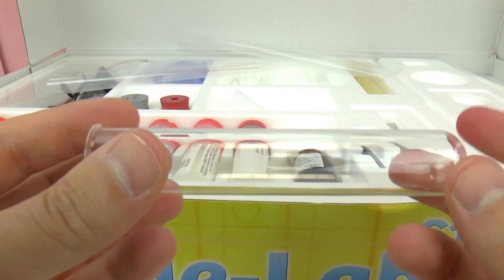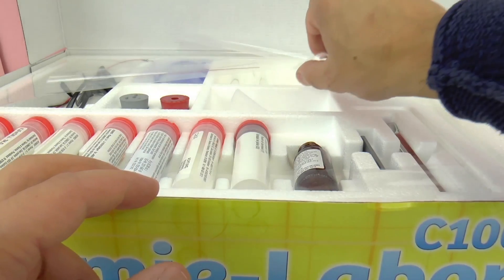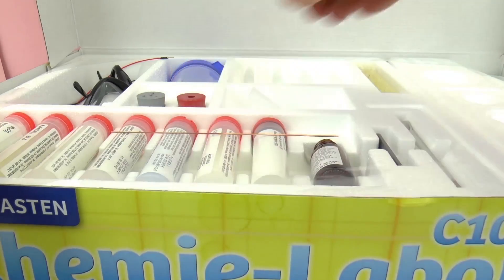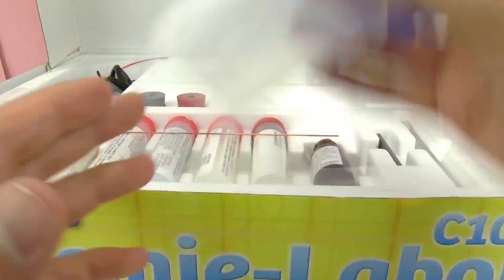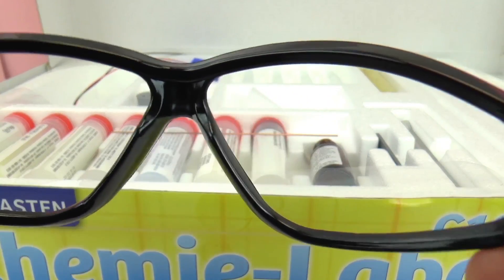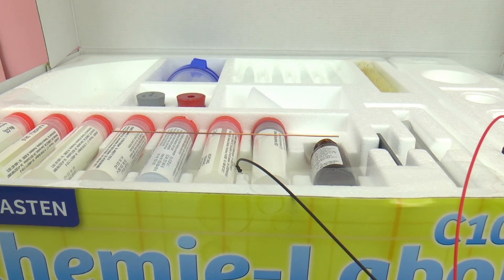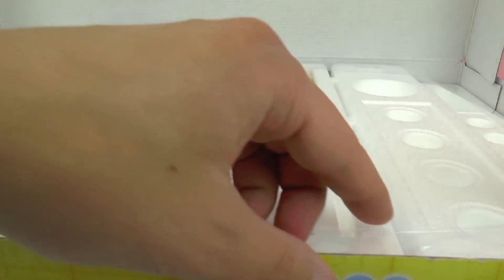Here we have some glass test tubes — very fancy. These are going to be used to mix different chemicals together and watch reactions. Also included is a toothpick of sorts. Here we have a brush to clean out the test tubes, a small canister, and safety goggles — this one is really important to make sure that nothing goes wrong and you keep your eyes protected. Here we have a small circuit, as well as three or four eyedroppers, a lid, and a funnel.